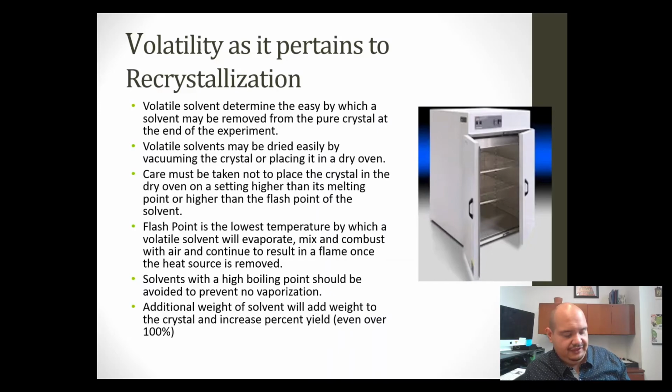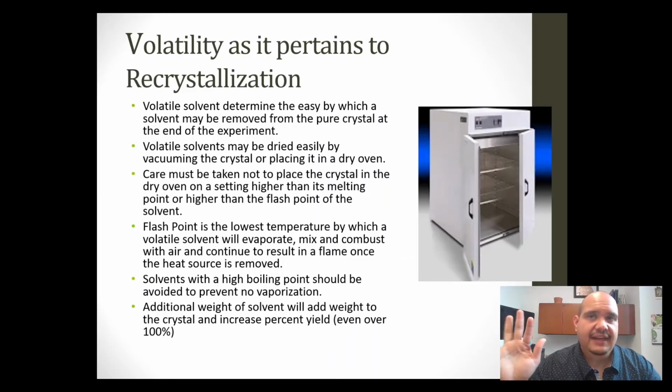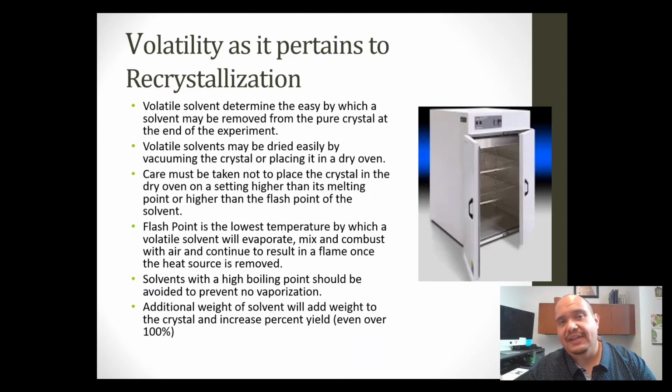And it's important to know that just in general, solvent and impurities add mass. If you see a number over 100, you're probably looking at an impurity. And if you should have recrystallized your crystal but instead precipitated it, that is most likely why you would see, again, over 100% recovery. So all of those 3 things are important to talk about if you should ever get data with a recrystallized product that is higher than 100%. There should always be a net loss. You should never recover 100 back.